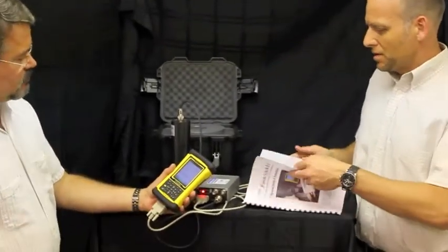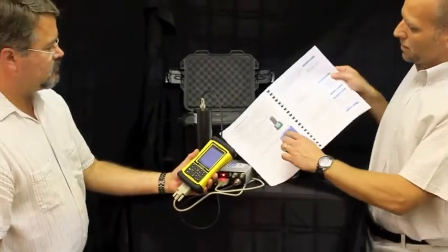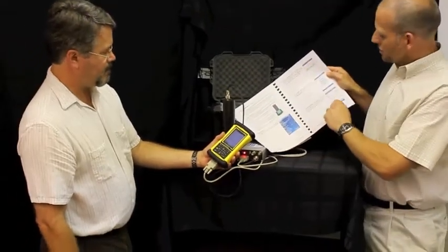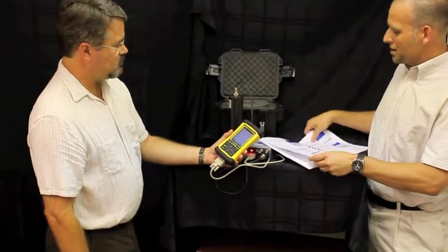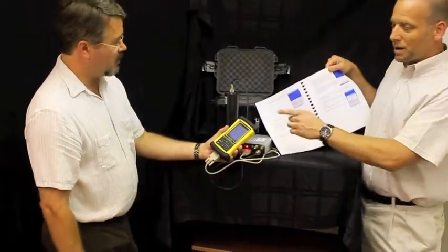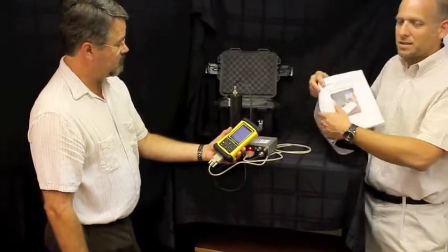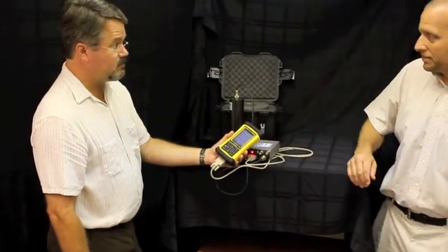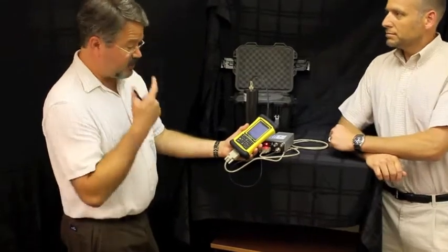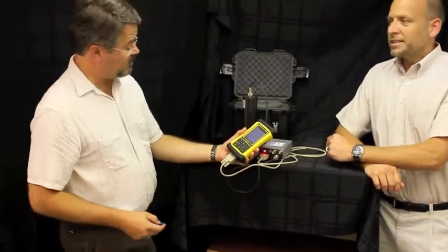Which has a picture of each menu item on the computer so it walks you through it visually as well as obviously with a technical description. That's good, it's an excellent point. This is simple to use and it helps make it even simpler.